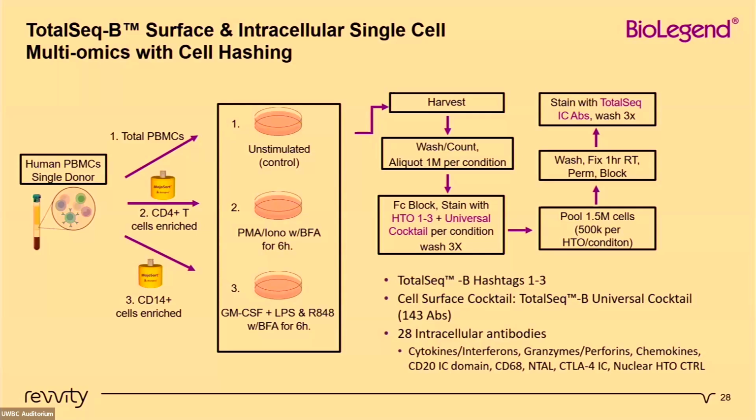And then we had CD14 enriched cells that we stimulated with GM-CSF, LPS, and this R848 stimulant, with Brefeldin A again for 6 hours.